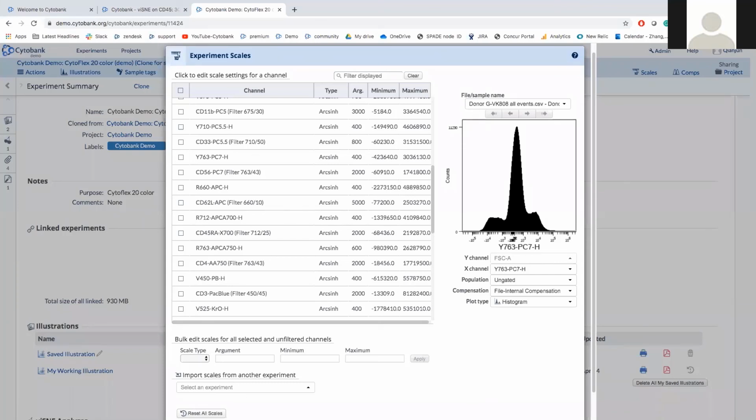So just make sure I answered all the questions regarding the scaling. Another question regarding scale is, do you have to do the scaling ungated, or would it be better to scale on cleaned up data with debris and doublets removed?